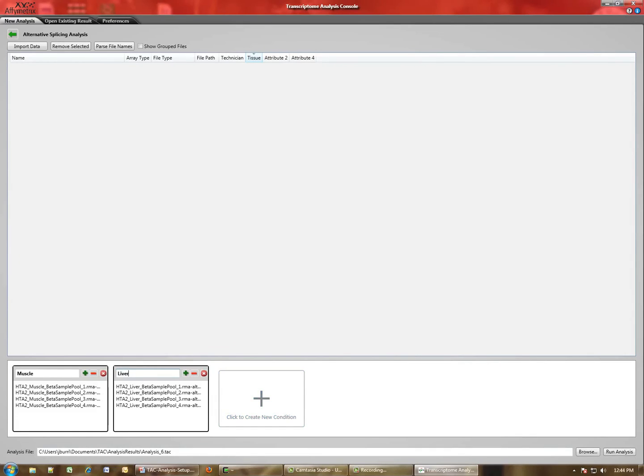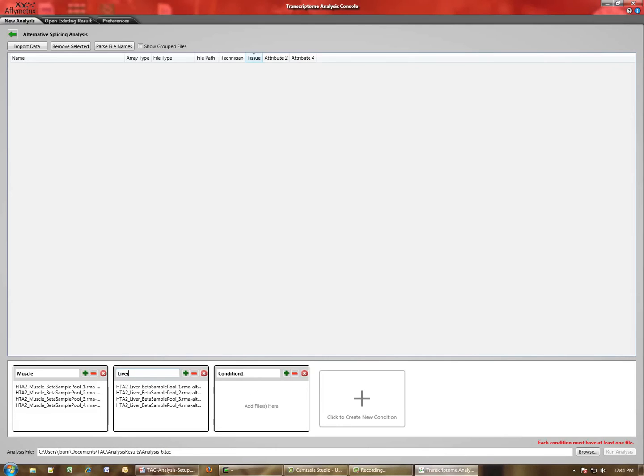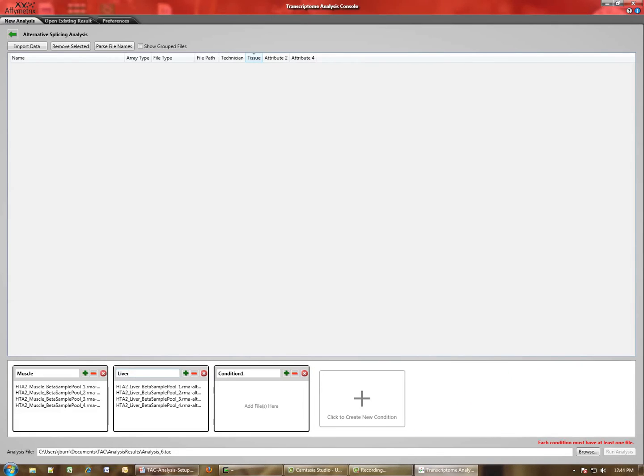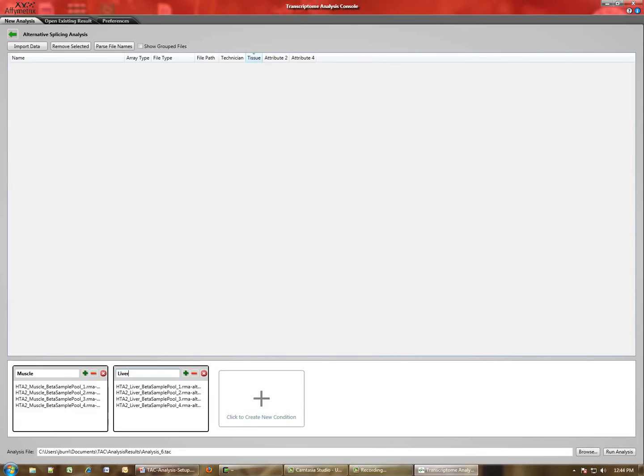If you had more conditions that you wish to investigate, you click the plus. It adds additional conditions, as many as you would like. You add the files into them as before. You'll note now that because we have two conditions without any files associated with them, we are not able to run an analysis. You have to have at least a single file in each condition in order for the analysis to be run.